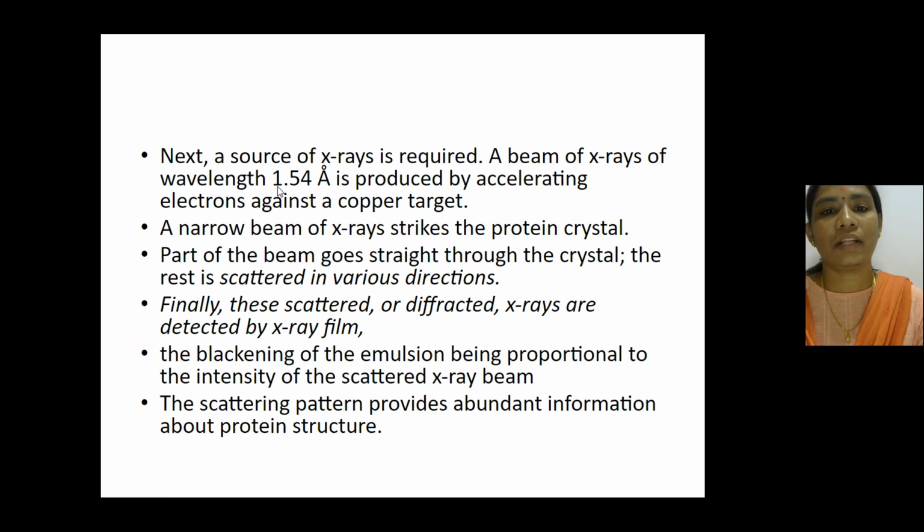The wavelength of this beam of X-ray is 1.54. This is also one of the important points, as many objective type questions may be asked. What is the wavelength? It is 1.54 Angstrom.